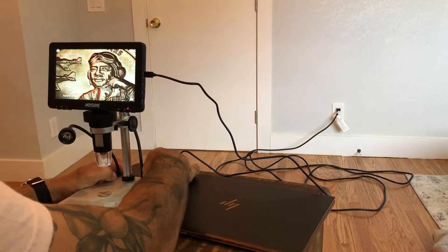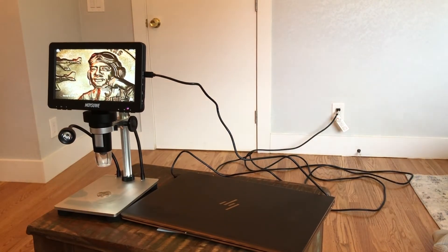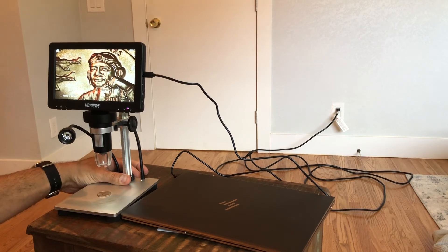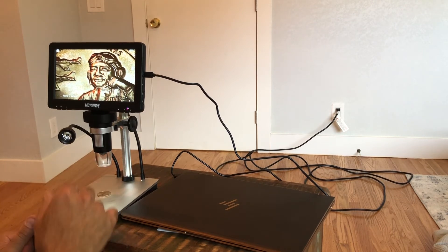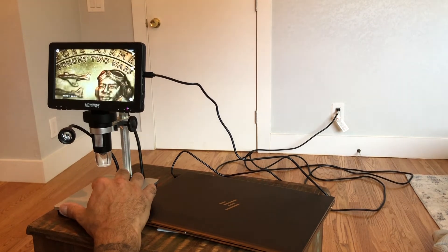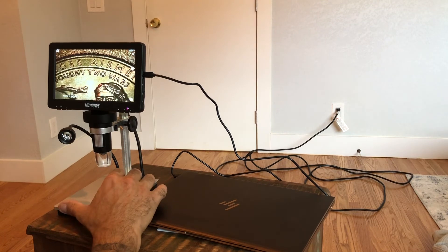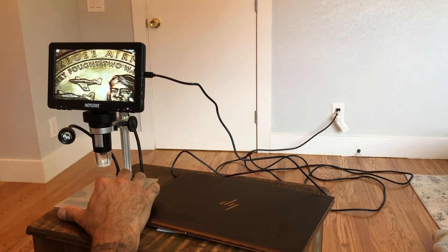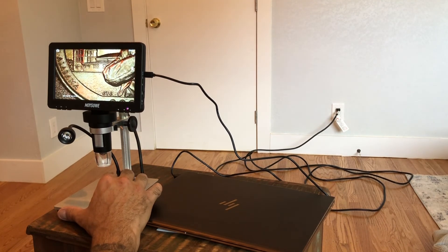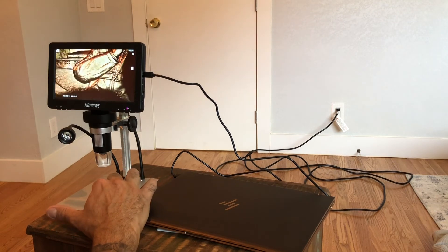Let's go ahead and get something under the microscope and show you guys the awesome quality. Here you go — a nice up-close view with a quarter underneath it. You can tell it's super good quality, really great images, very clear, super easy to read. There it is — it's an Alabama quarter. We can read that nice and easy.